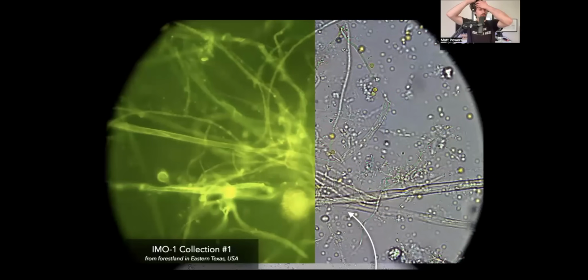So this is bright field on the right, and I chose fungi that was visible. So this would actually be useful, because otherwise you're going to be like, huh? Right. But you can see how dramatically different the space is. While bright field tends to make things look much more 2D, there's a three-dimensional depth to epifluorescence.